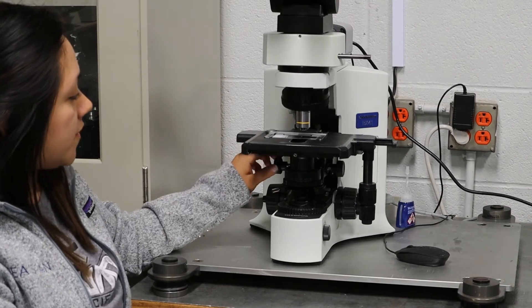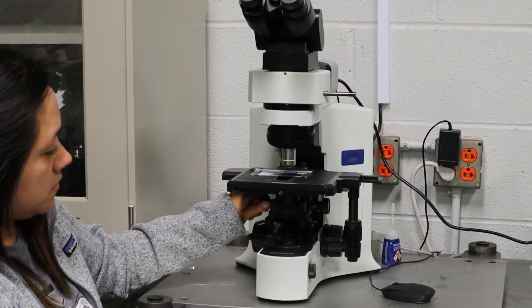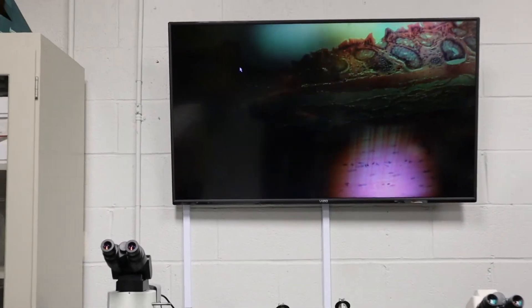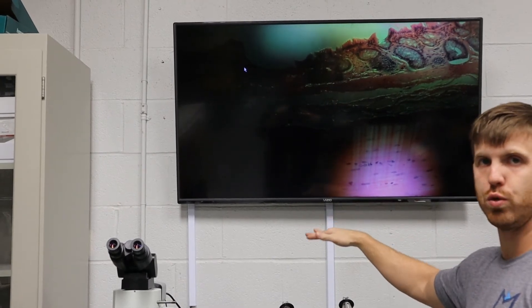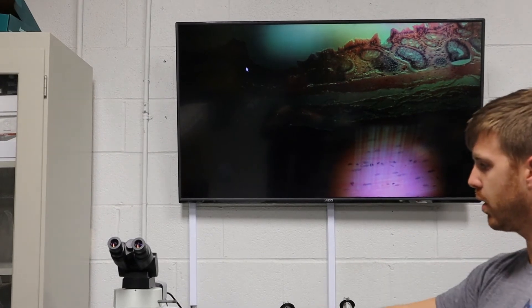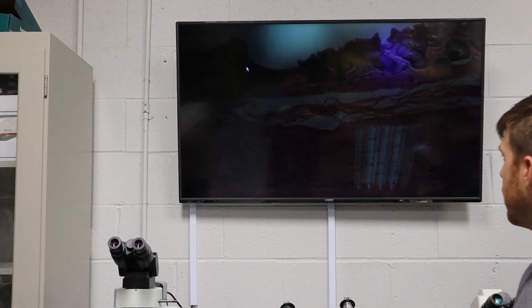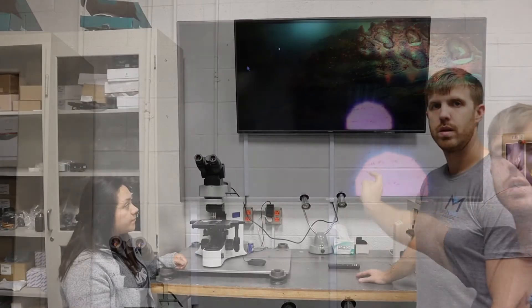First we're going to make sure that our condenser is at the right height by adjusting this knob and moving it up. You'll notice that whenever it was really out of focus when she was too low, and as she got higher the edges got sharp. Go ahead and adjust it until the edges are really sharp, Maria. Right there is what you want to see.